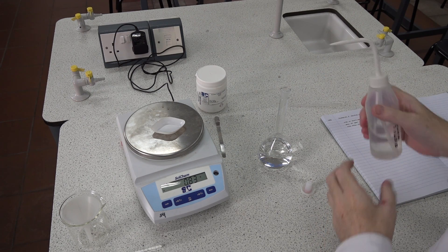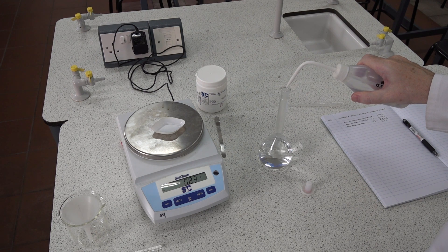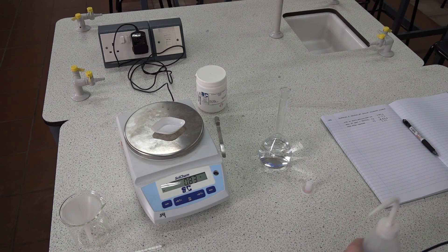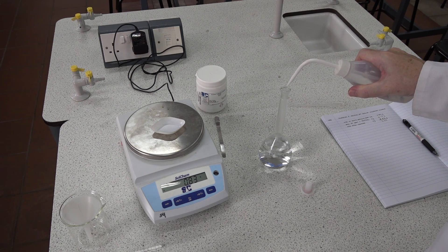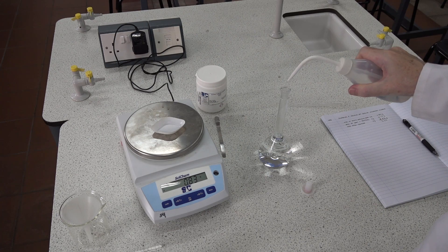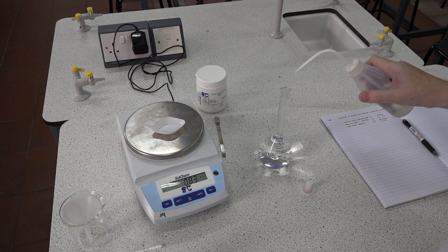Now in this flask the line to fill to is here, so we need to add quite a volume of water. You can use the wash bottle to squirt it in, or you can take the top off and pour into the funnel — whichever seems appropriate. Again, place the wash bottle down. We're still about three centimeters below the line.